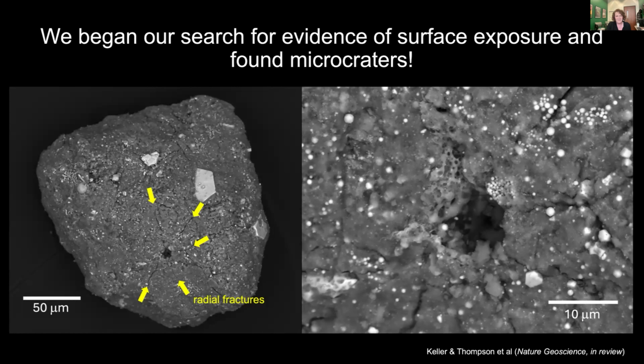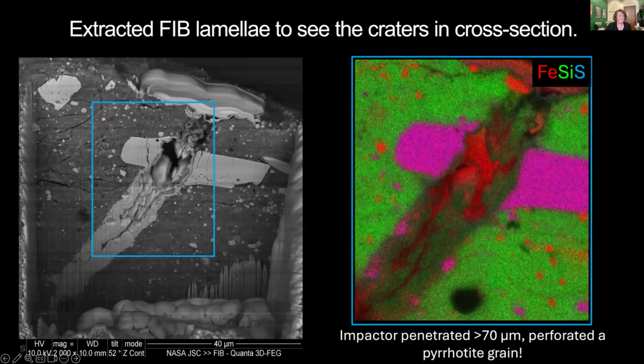Now, it wasn't enough for us just to say, okay, great, we've seen evidence for space weathering on the surface of the sample. We wanted to know what this crater looked like in cross-section. So we extracted a FIB section, so now a cross-section of that crater. You're looking at the surface of the sample here, and you're going into the grain interior in this direction. And we could trace the track of that impactor throughout the grain from asteroid Bennu.